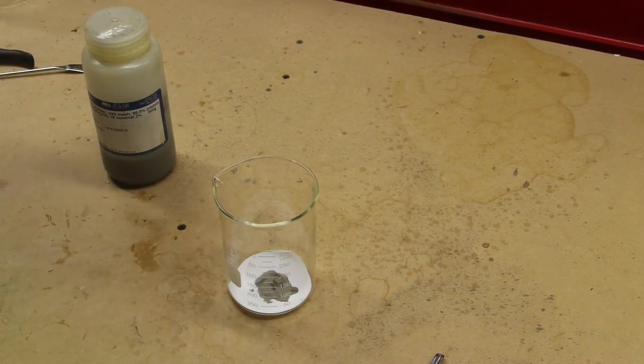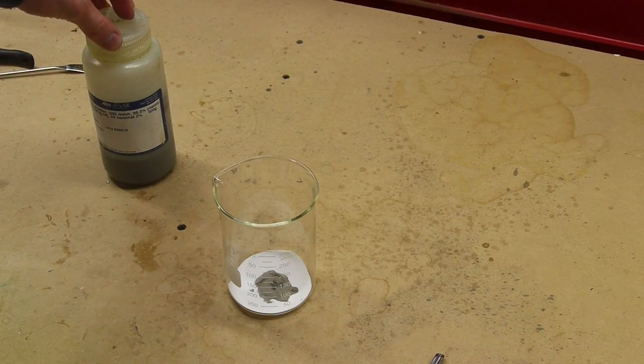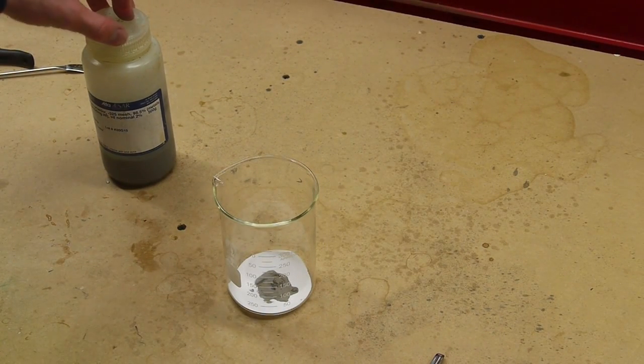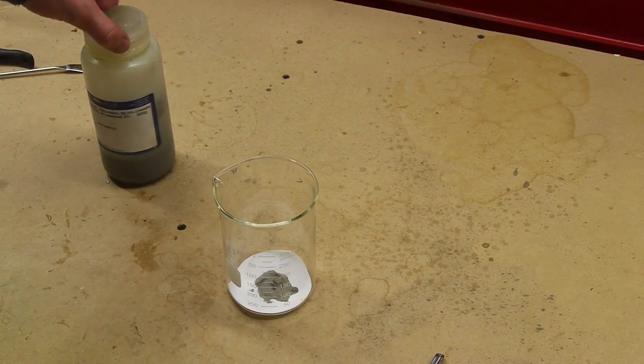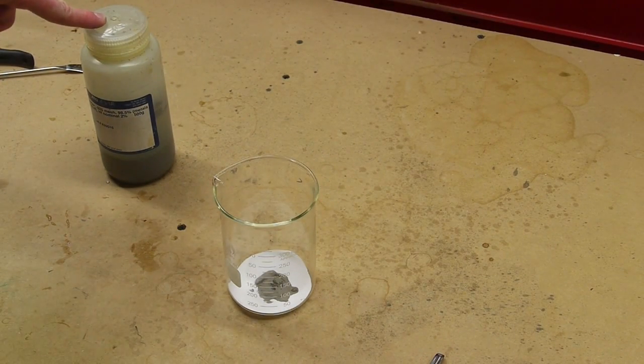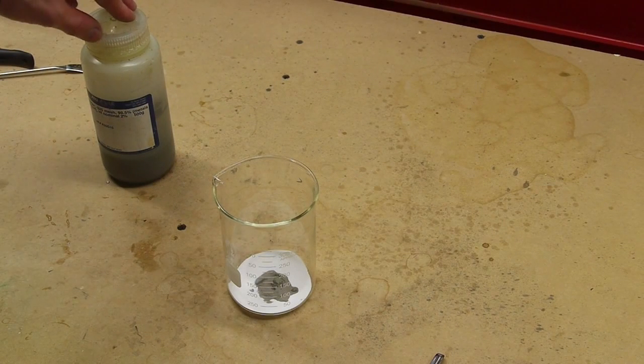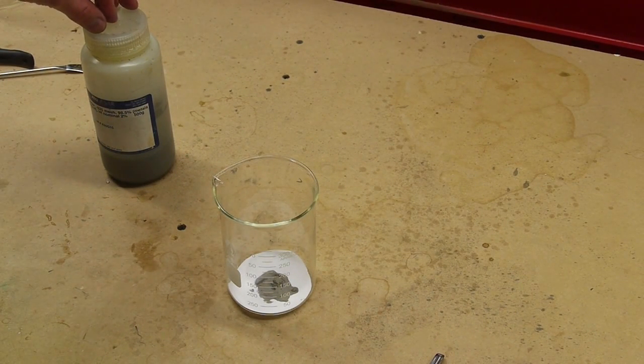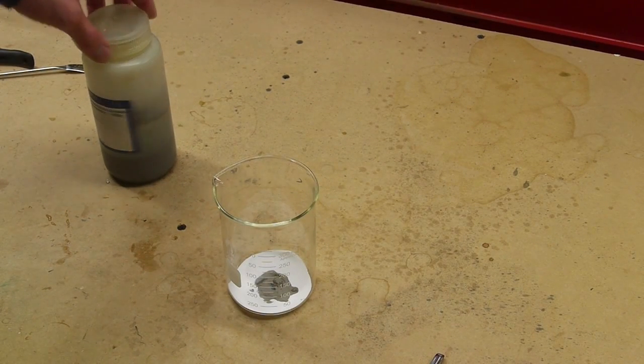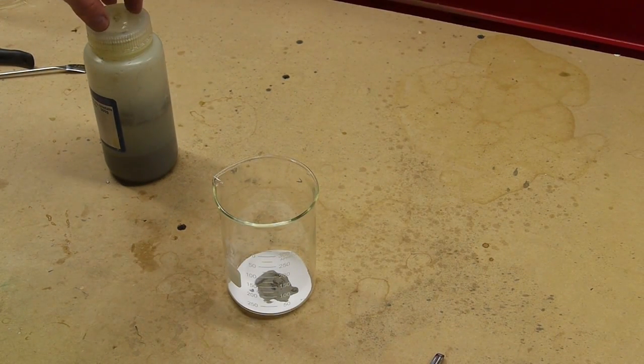...and the really fine zirconium powder is explosive and pyrophoric, meaning that if you expose it to air, it can self-ignite, which is always fun. So it's stored underwater, but a lot of the MSDS safety sheets say that you can't allow dry zirconium powder to become wet, which is a little confusing. Why is it stored underwater if you can't allow the powder to become wet?